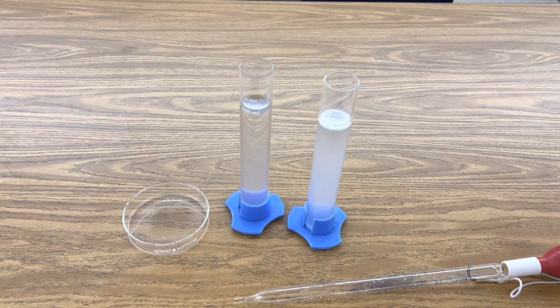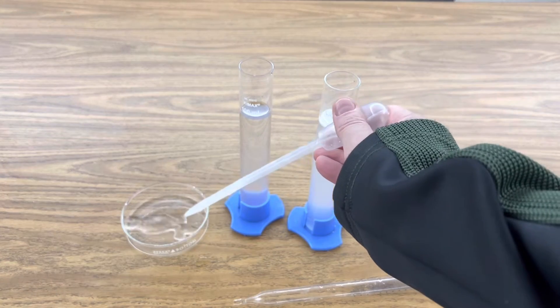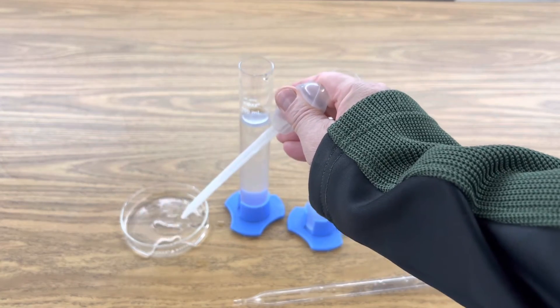Now I thought part of this would look fantastic in a petri dish, so I'm going to take our aqueous solution of manganese sulfate and just coat the bottom of this petri dish here. Now we're ready to start adding drops of our sodium hydroxide aqueous solution. Here we go.